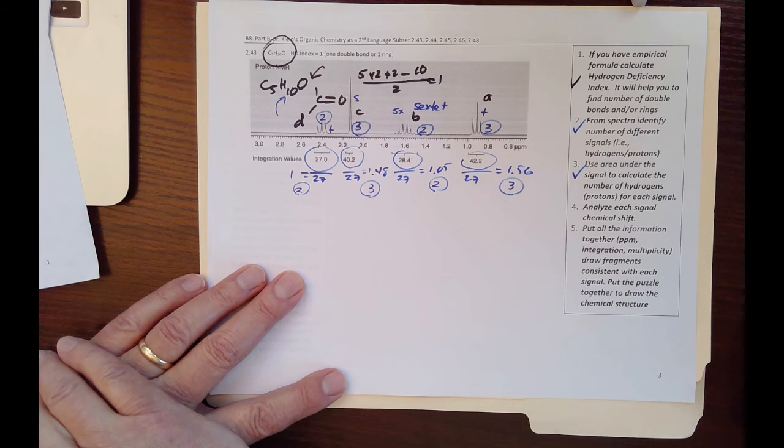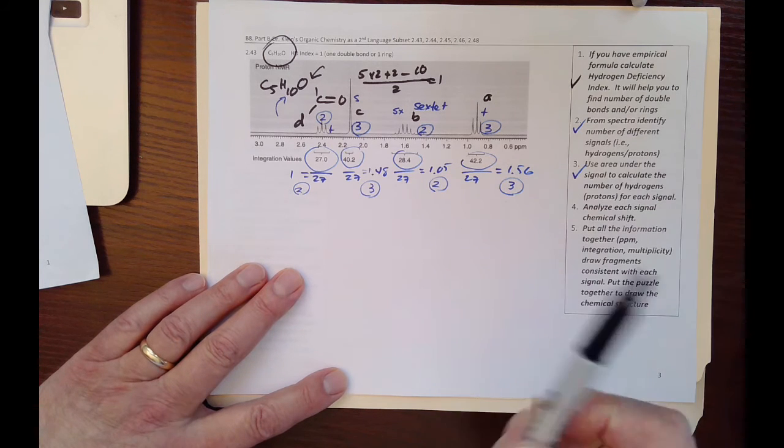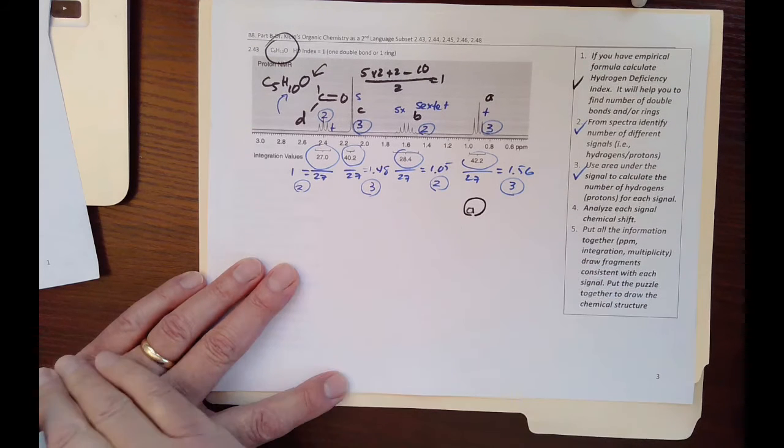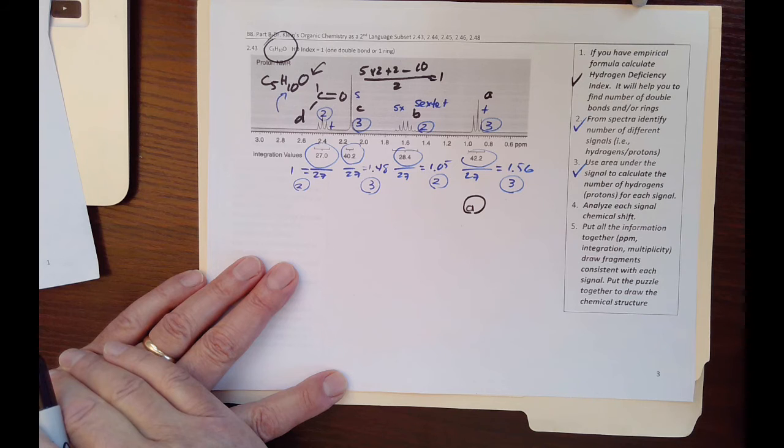So let's look at A as a triplet, and we know there are 3 hydrogen there. Those 3 hydrogen become a triplet.